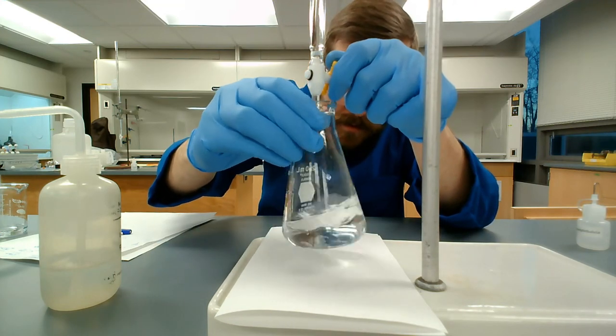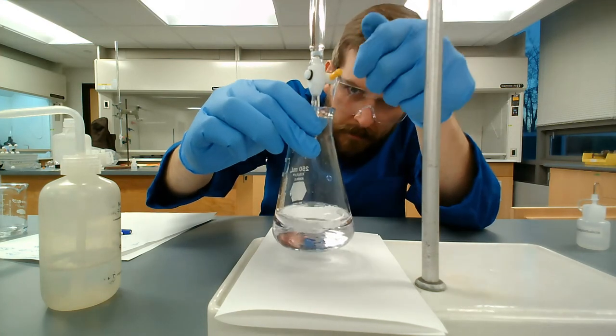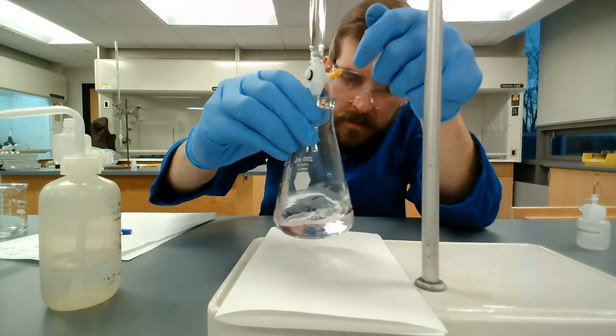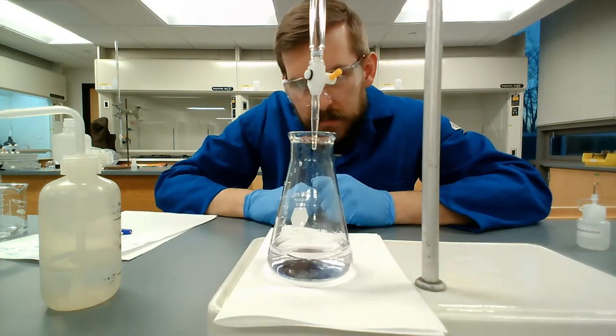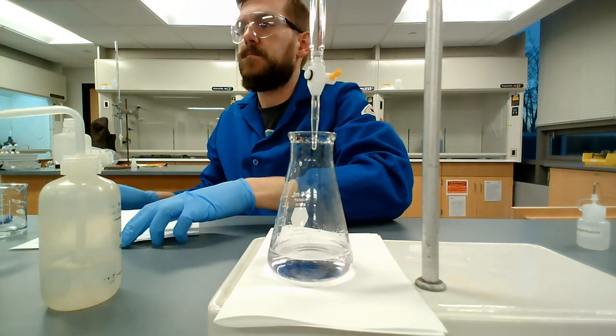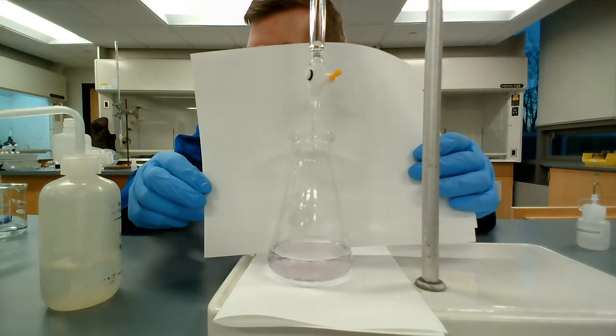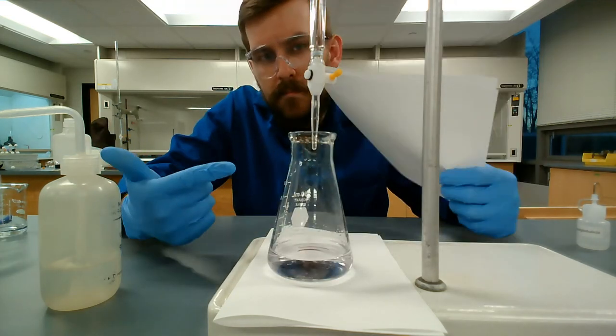So I'm now maybe doing a drop every 3 seconds. There's a drop, 1,000, 2,000, there's a drop. Right. So I'm going really slow here. I think that's it. Yep, that looks like it's it. The color's still persisting. It didn't disappear after a few seconds.